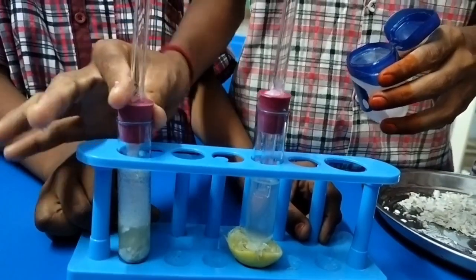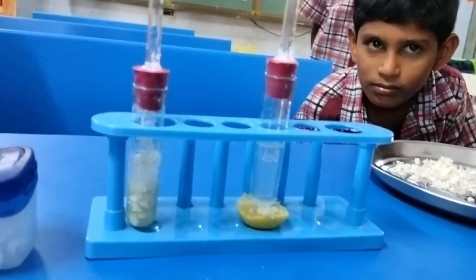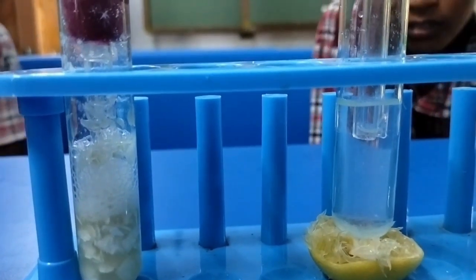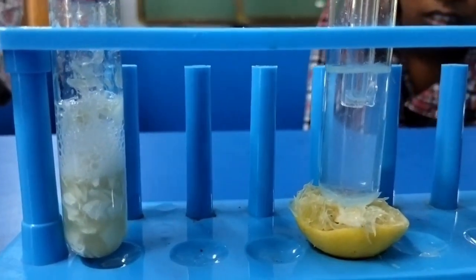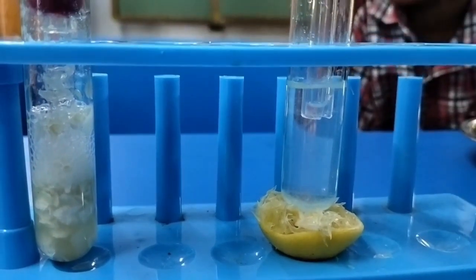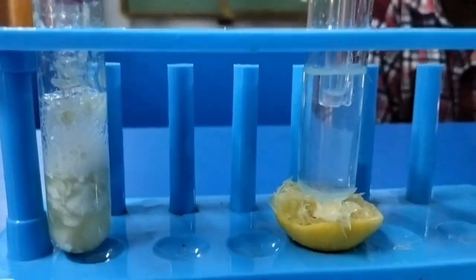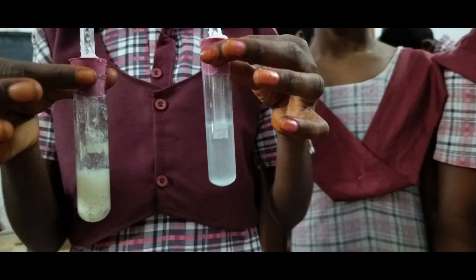We have to do the same with the other test tube. Now we will observe what will happen. We can see bubbles releasing into the lime water. We observe a cloudy environment in the lime water. As seen in the picture, the lime water has converted to milky white, hence it is proved that carbon dioxide gas is released when eggshells are added to the lemon juice. Thank you.